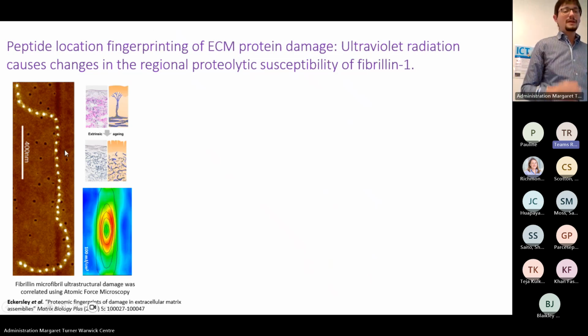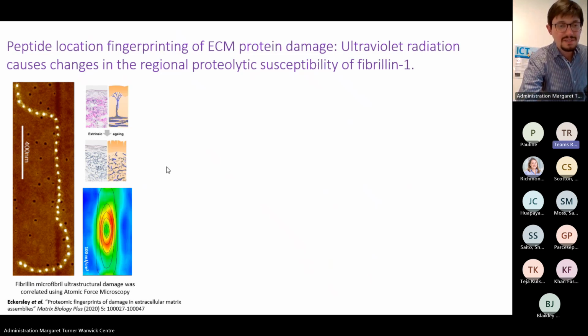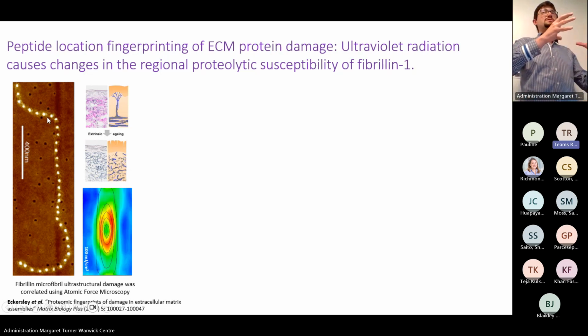And what's interesting is you can irradiate these with a physiological dose of UV, similar to that of the sun, same waveband composition. And you can look at whether the structure of these beads change. And actually, when you irradiate them, the beads swell. So you can imagine a ball of string unraveling. It gets bigger. And so you see that bead swelling, and then the distance between the beads also increases. So you know that you're inducing some kind of structural change, and you can validate that.